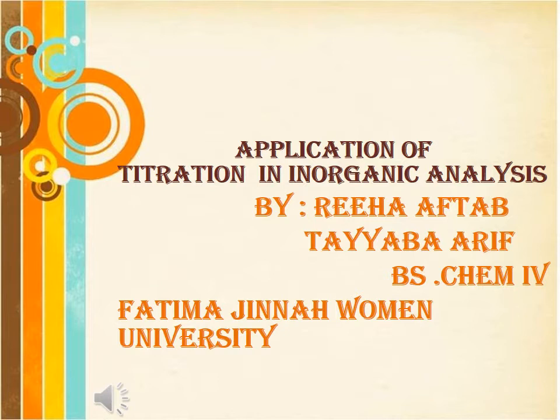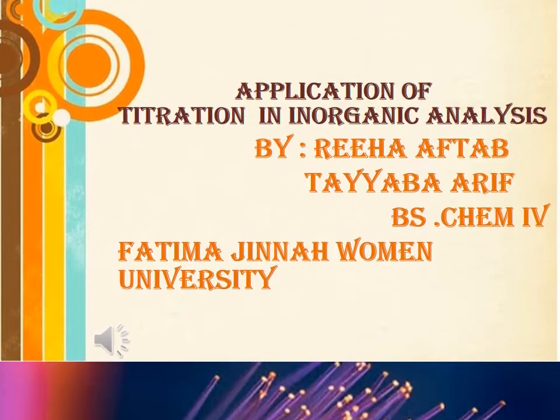We are going to discuss the application of titration in inorganic analysis. So inorganic analysis basically involves a variety of analytical methods which can qualitatively or quantitatively determine the inorganic and elemental compositions of solids, liquids, aqueous solutions, chemical mixtures, materials or products. So inorganic components include cations, metals, anions or inorganic salts.